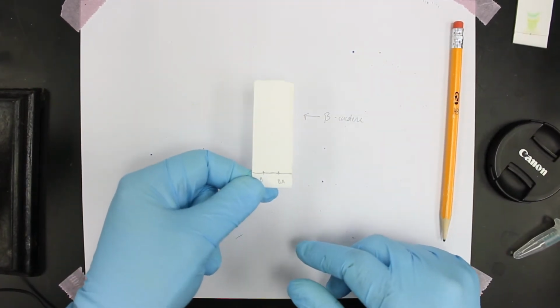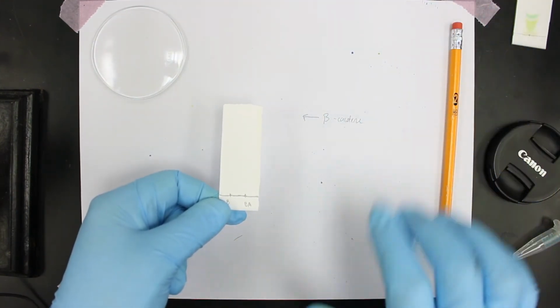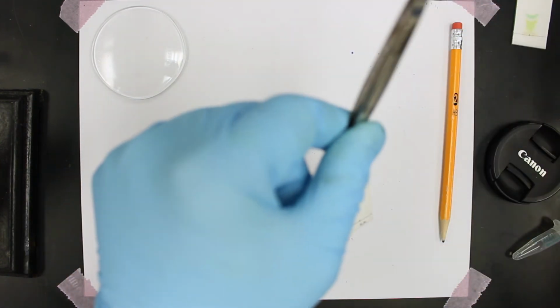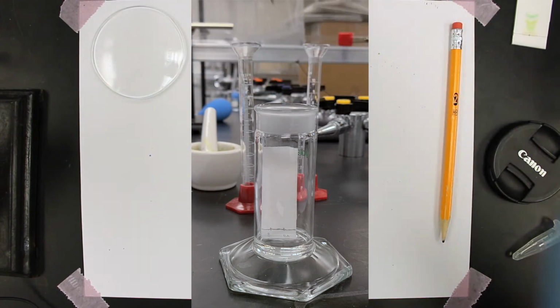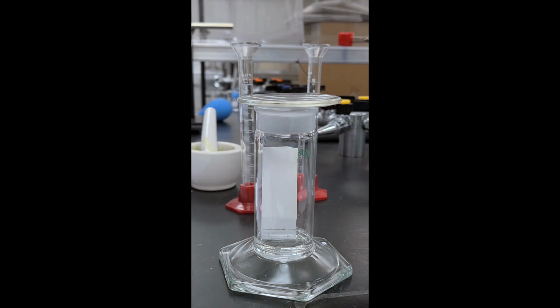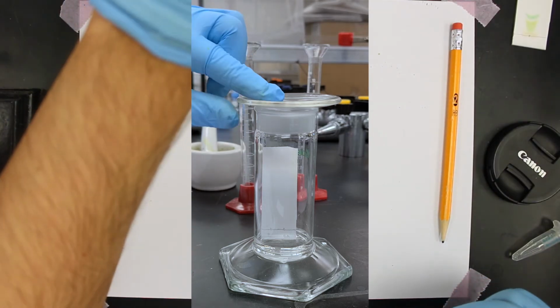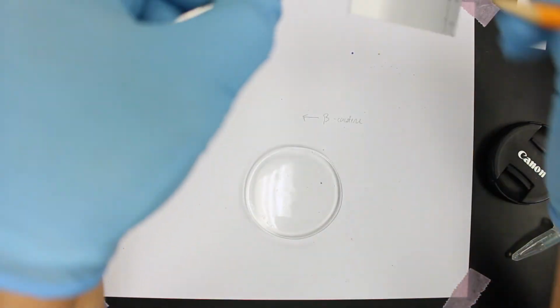Alright, so we've got our TLC plate here, which is prepared, and we've changed the mobile phase. So we've changed the mobile phase from the previous solvent, and now we're using 20% ethyl acetate and hexane. So we can take our plate, and we can use our tweezers to place it into the chamber. Cover it and wait a few minutes. So it looks like our TLC plate is done, so we'll extract it from the chamber. Okay, and mark the solvent front.